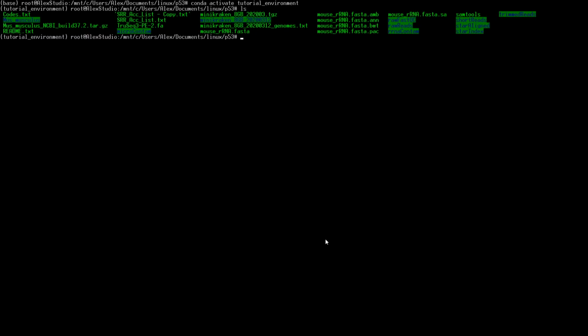So when we aligned with STAR, we aligned our reads to the different locations depending on the annotation file that we also had fed in. So now we have to go through and count what feature, or what transcript, gene, whatever we want to tell it, each of those mapped reads is actually mapping to. And then later on we can go and analyze the different genes and everything like that.